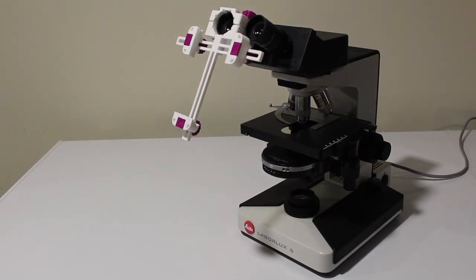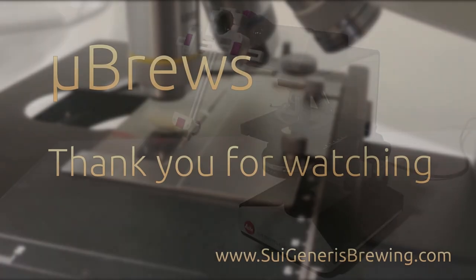So that is a quick tour of the major parts of your microscope, some of the basics of handling your microscope, and a few suggestions on features to look for on your microscope. So join me in episode 2 for a tour and explanation of your microscope's lenses.